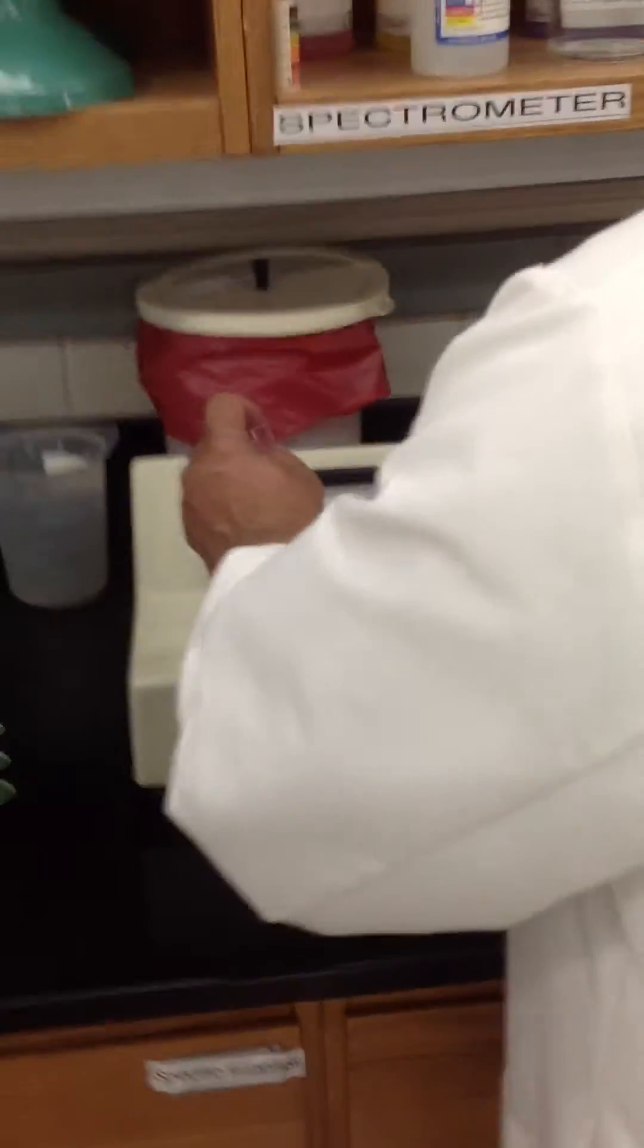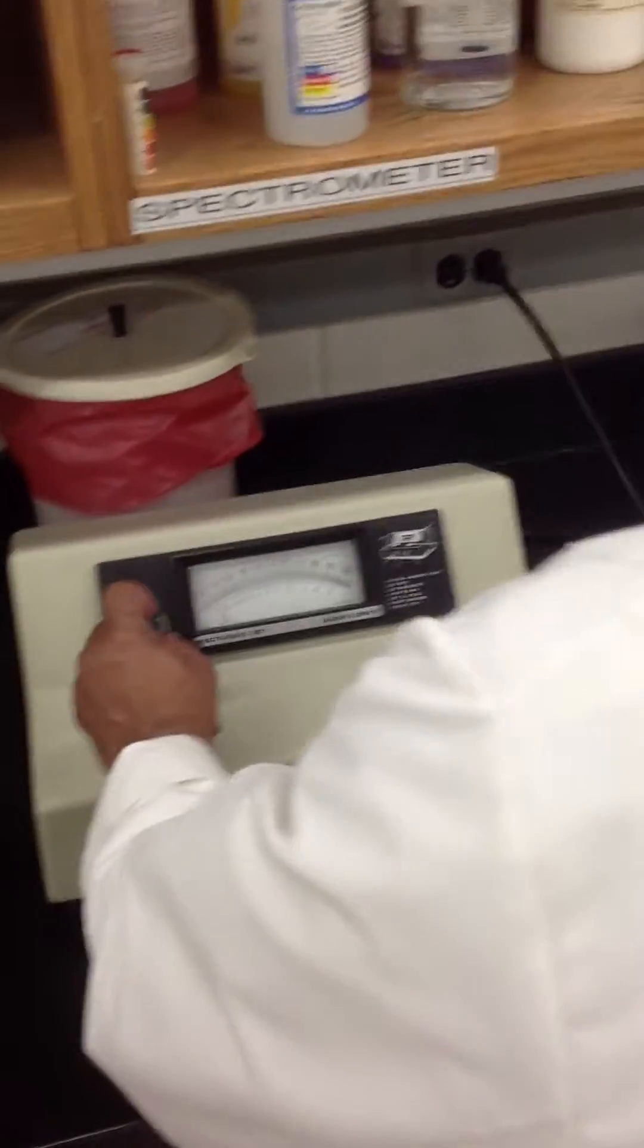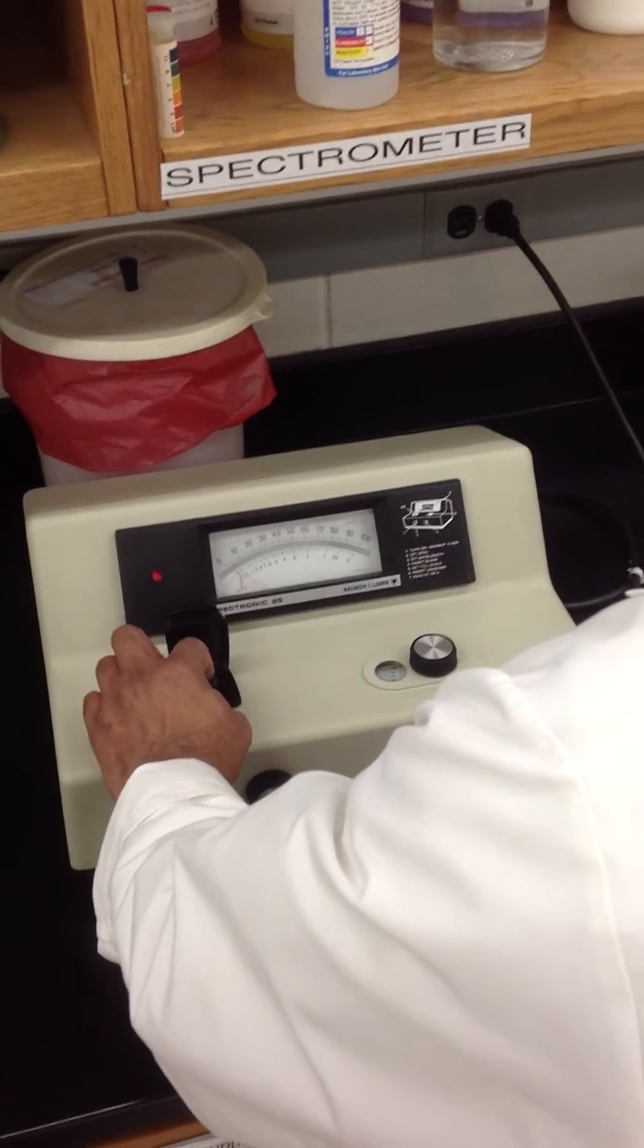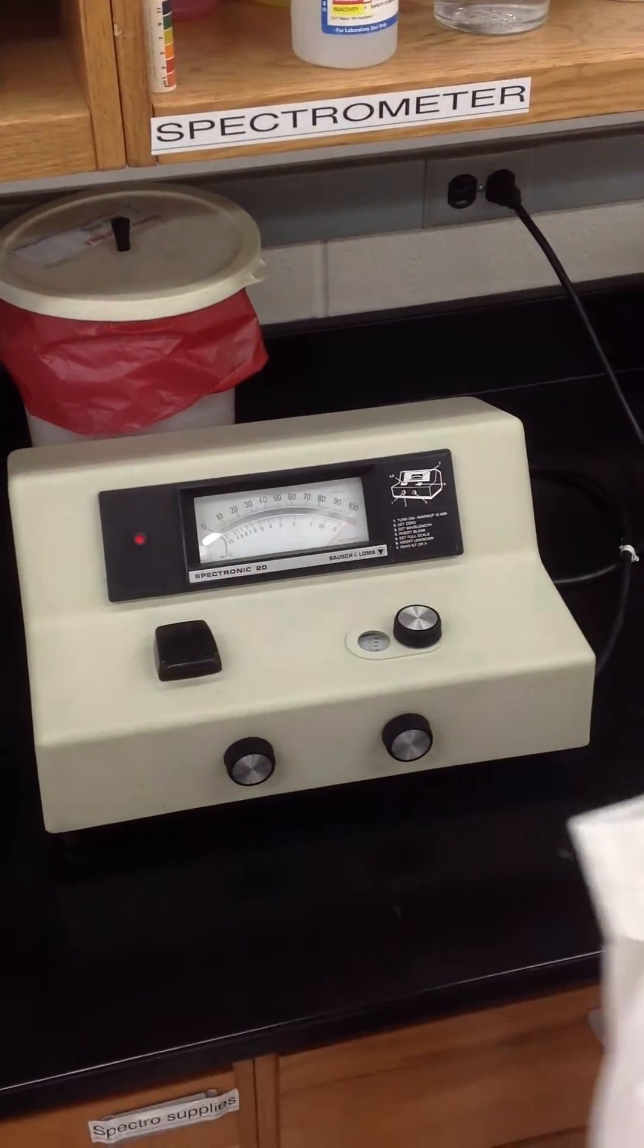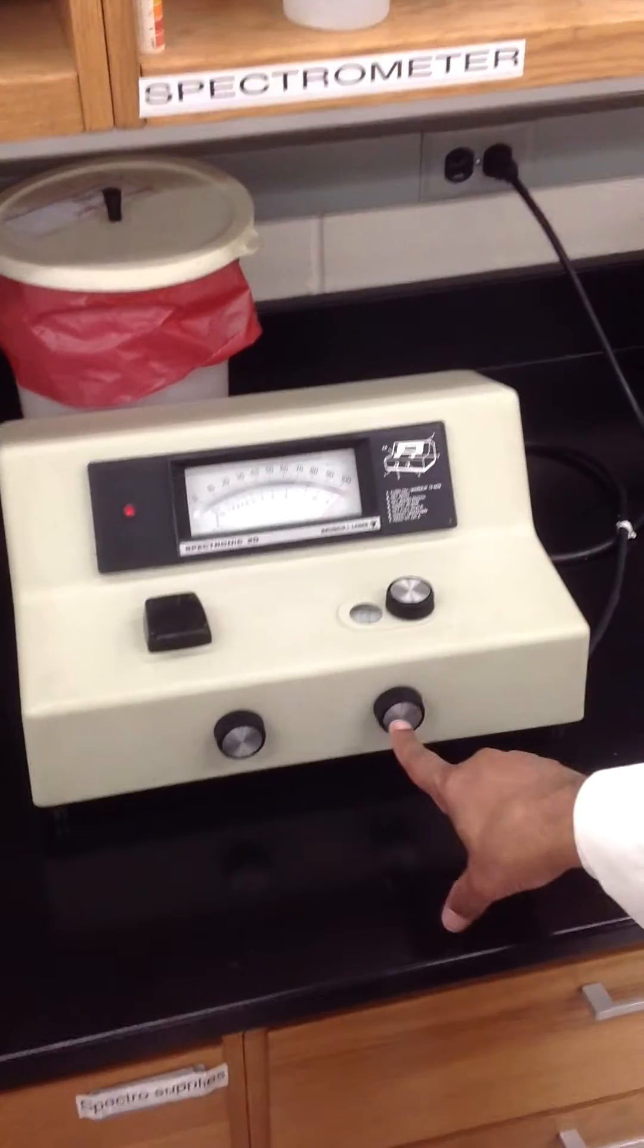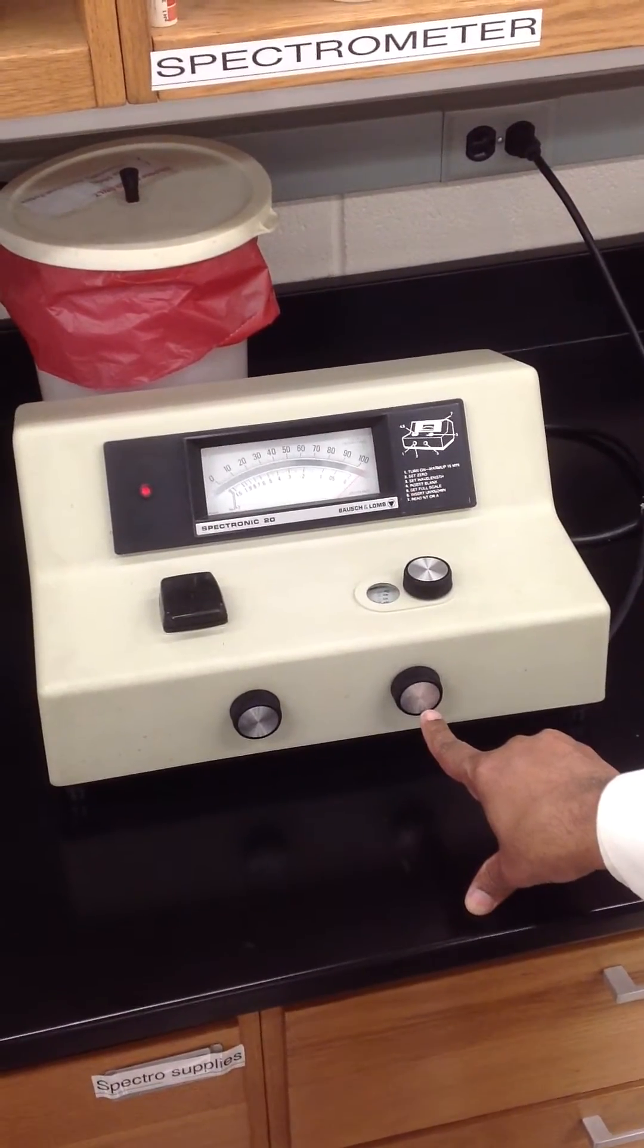So once you turn it on, to zero it, you must have a tube in here or else you cannot zero it. So you put your blank solution and you actually zero with this knob.